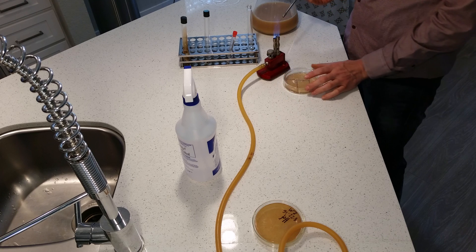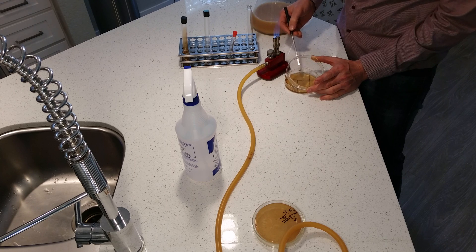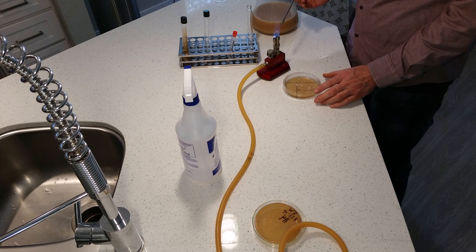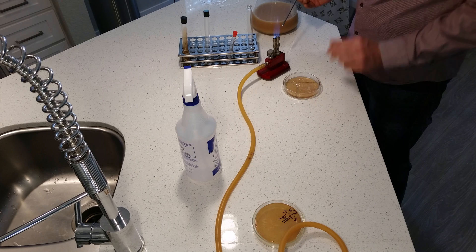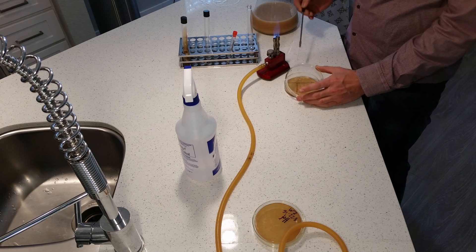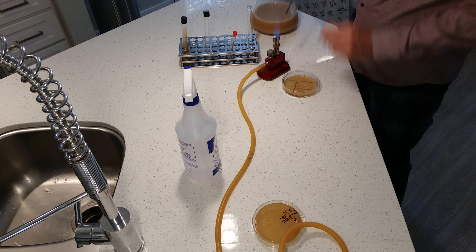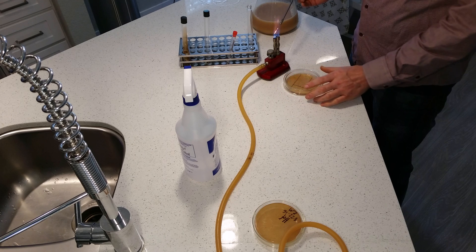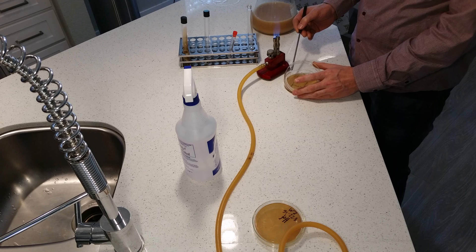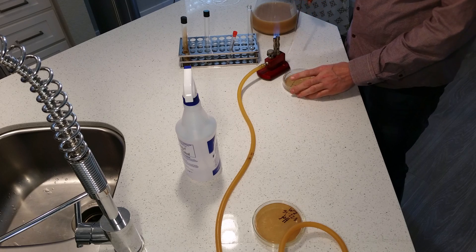We'll turn it 90 degrees. From here we go in, grab at least twice back and forth into quadrant two. Then burn the loop again, streak out and back for quadrant three. One last time — let it cool off. The way you can test that it's cooled off is to touch the edge of the gel; if it doesn't hiss then it's ready to go. Once, twice, back and forth into quadrant four. And there you go.